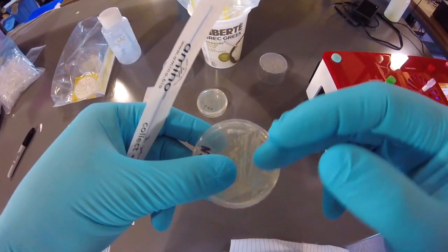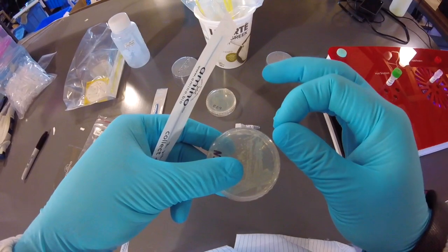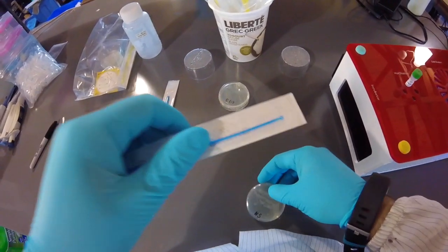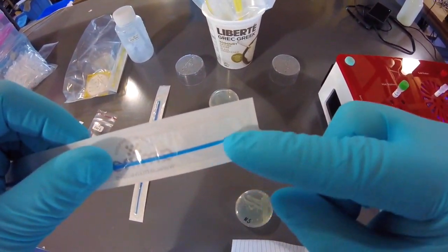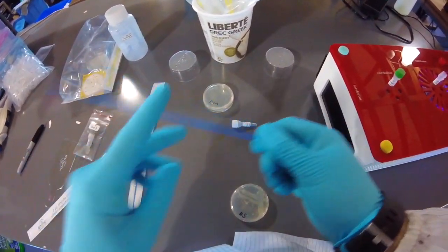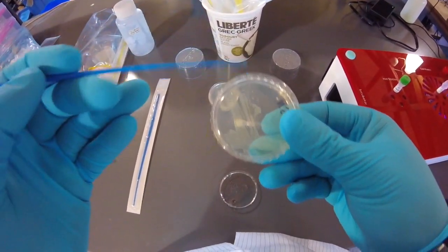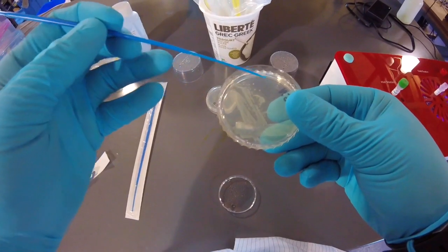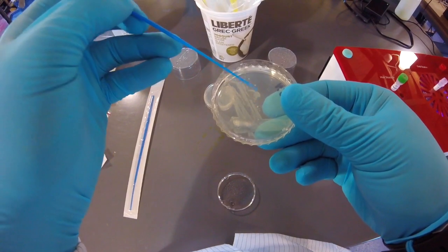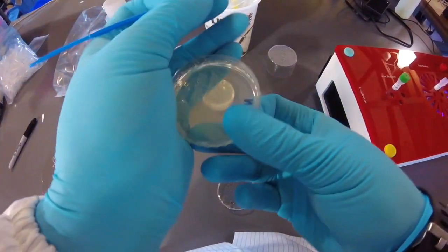It really depends on how long you've let this grow, right? So if I looked at this after 12 hours, these colonies are going to be much smaller, maybe even half the size. And so I might need to collect more colonies in that case. But the goal is to have a nice little bunch of cells filling the center of this loop, okay? So again, just pop the back out there. And let's just have a look here. So yeah, I'm just going to go for these small ones here. Might be a little bit wet, so it might just drag on the agar. Go this way here.